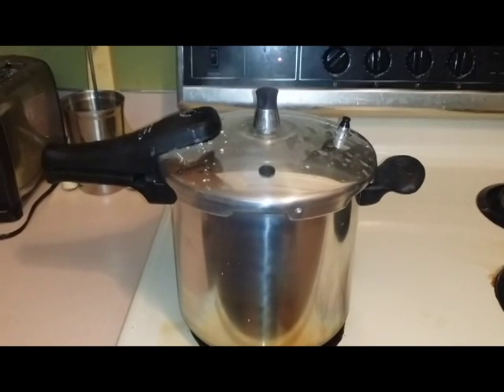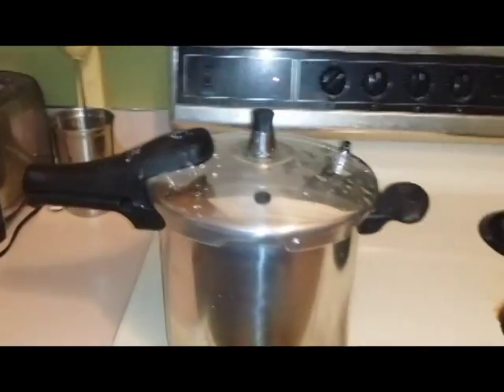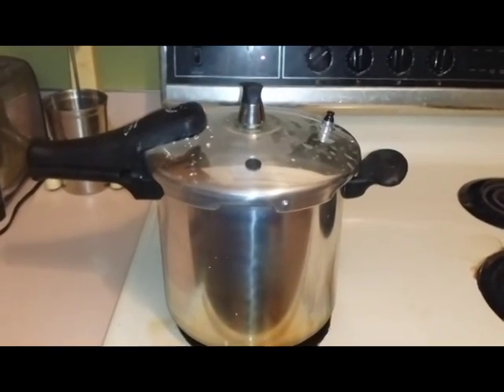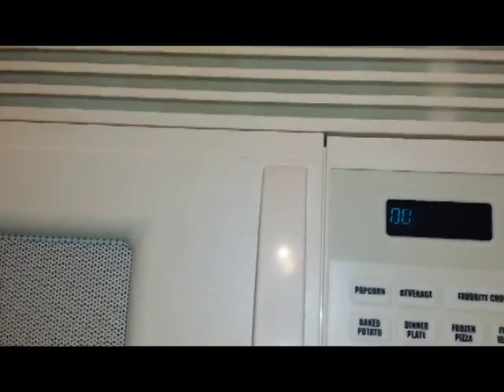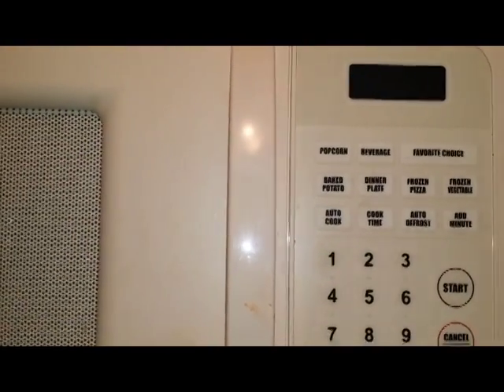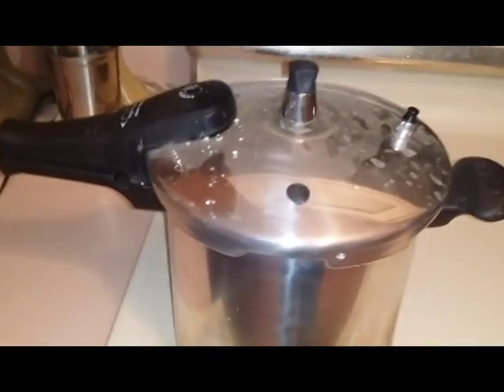Now you can see the pressure cooker is really going because this thing on top is bobbing and it's giving it that weird scrappy sound. So now you can set your timer for at least 15 minutes. You may want to do it for longer depending on how long you want your sterilization to be, but certainly at least 15 minutes.